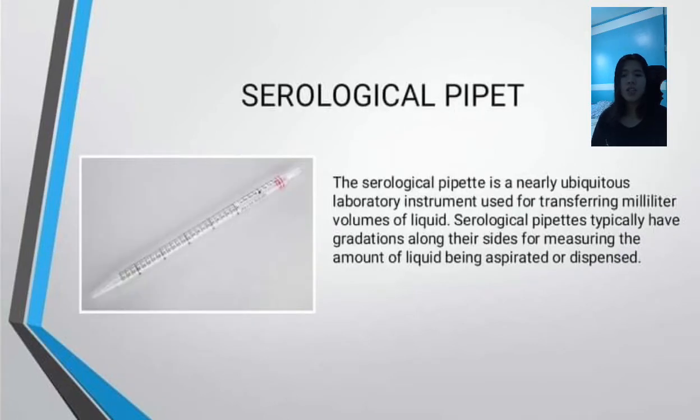And the serological pipette. The serological pipette is a nearly ubiquitous laboratory instrument used for transferring milliliter volumes of liquid. Serological pipettes typically have gradations along their sides for measuring the amount of liquid being aspirated or dispensed.